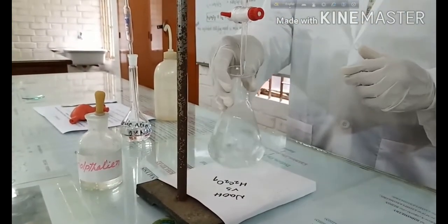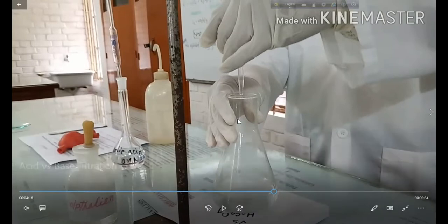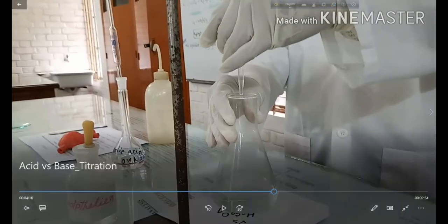Okay, so now can you see that we are adding phenolphthalein, but it's not showing any color because in the conical flask it is acid, so pH is less than 7. That's why phenolphthalein is not active in this solution, because phenolphthalein is also another weak acid. So acid in acid will not dissociate itself or each other. So that's why it is still colorless.